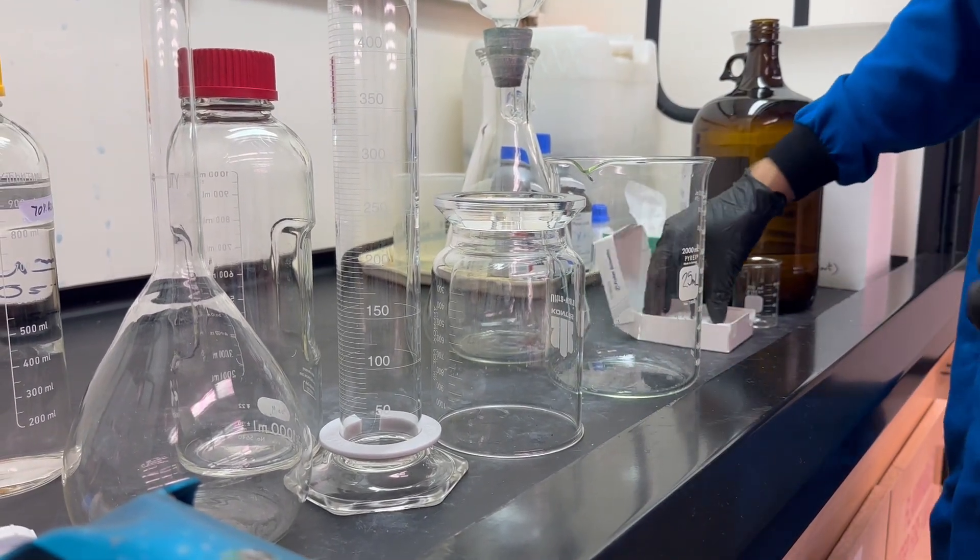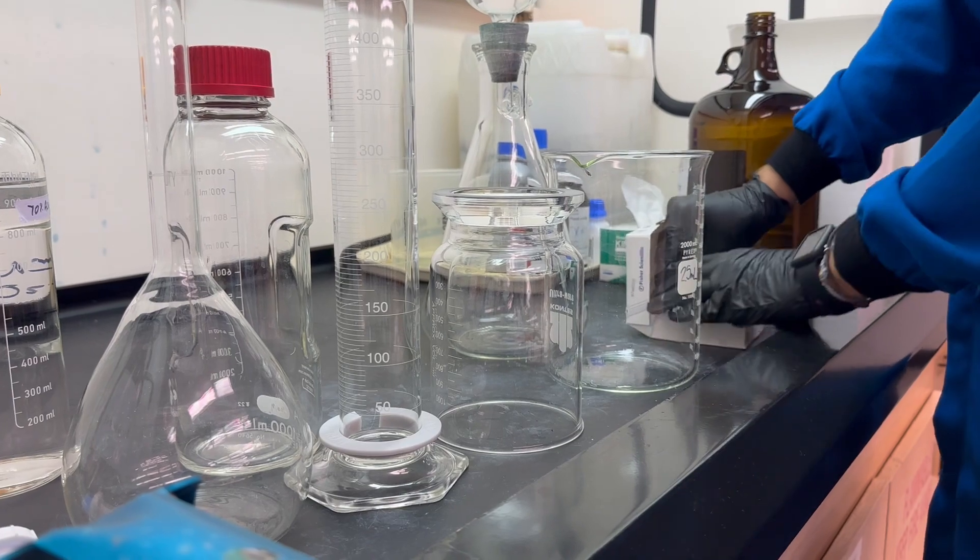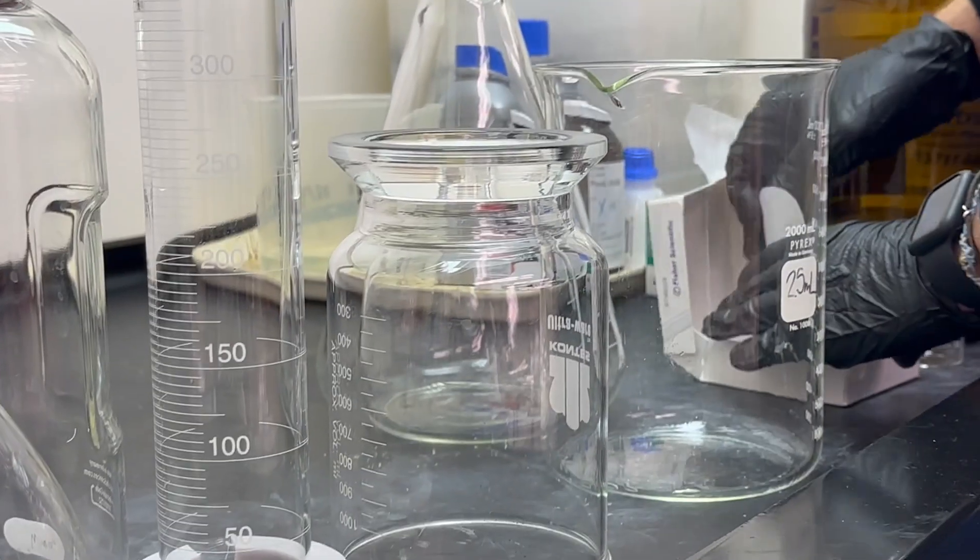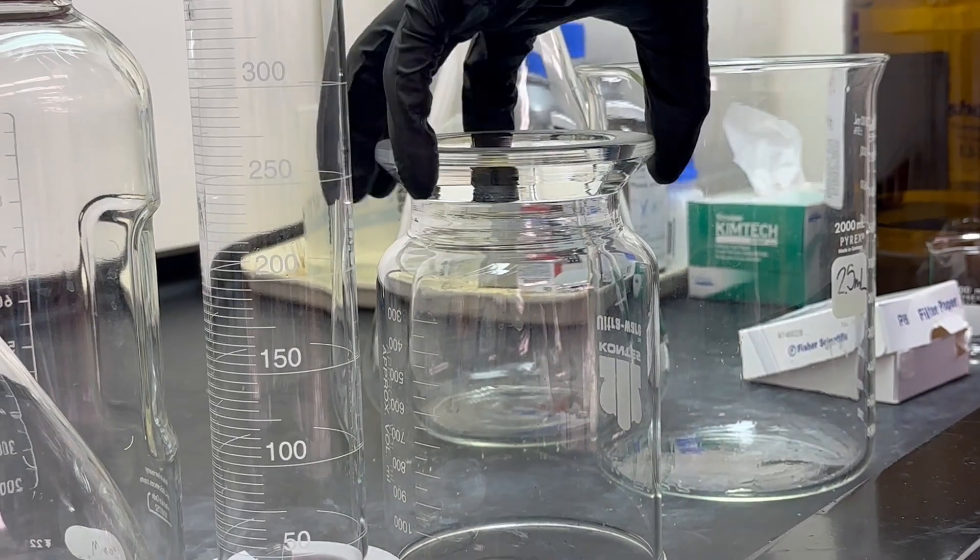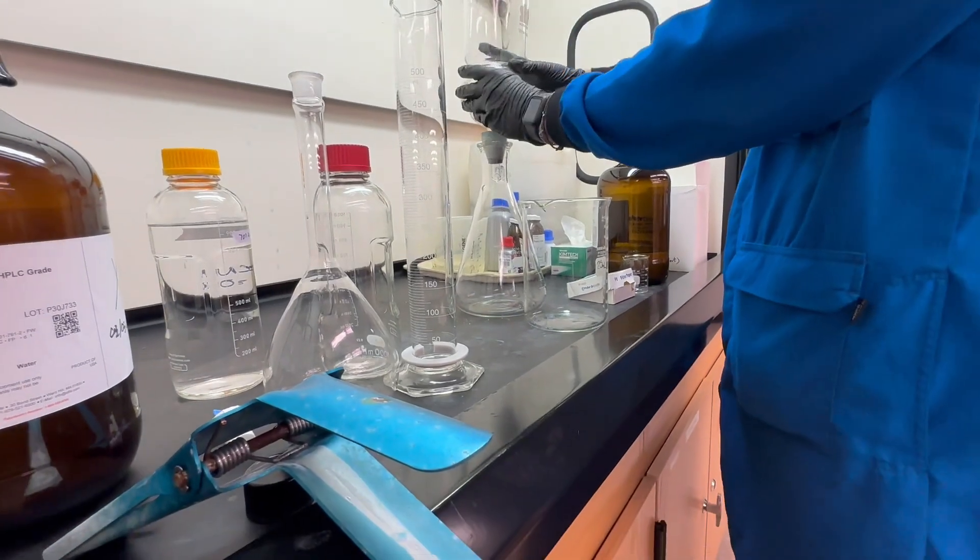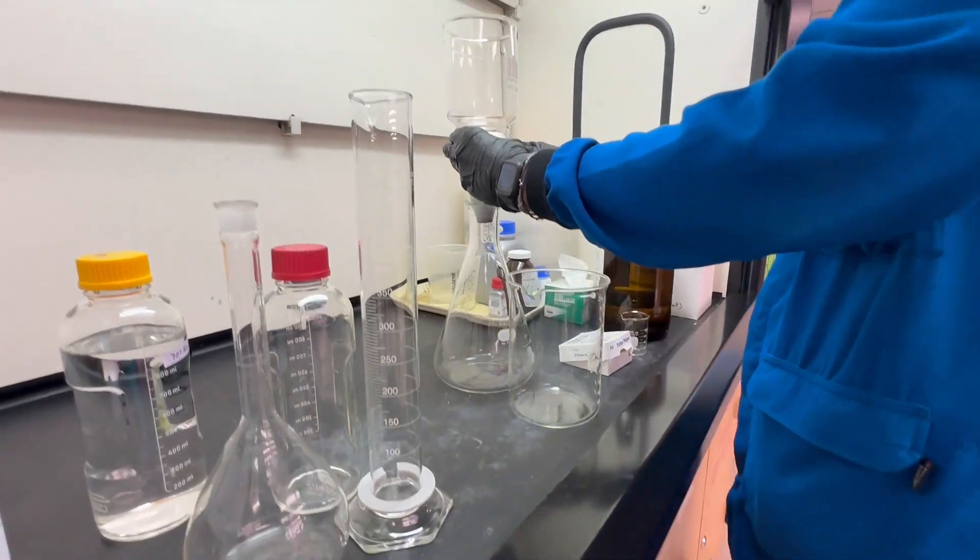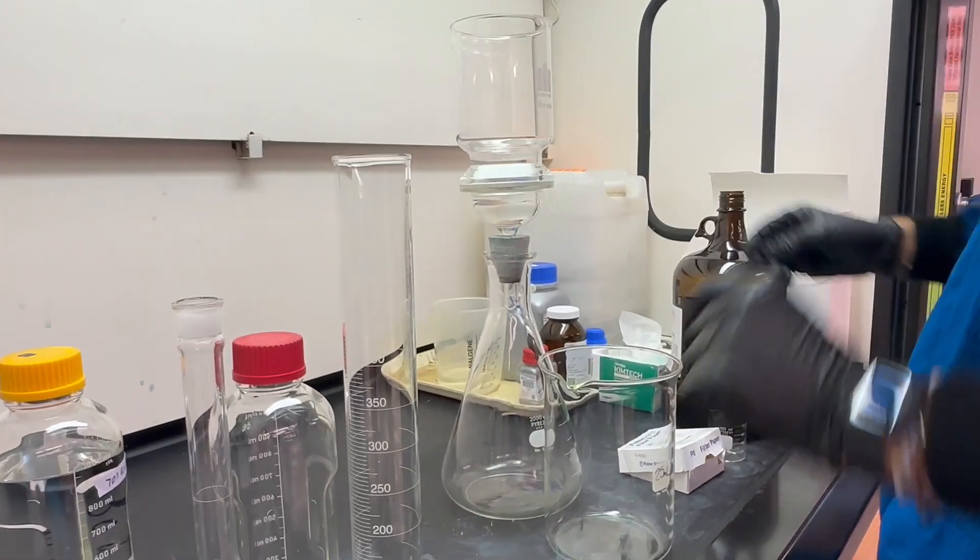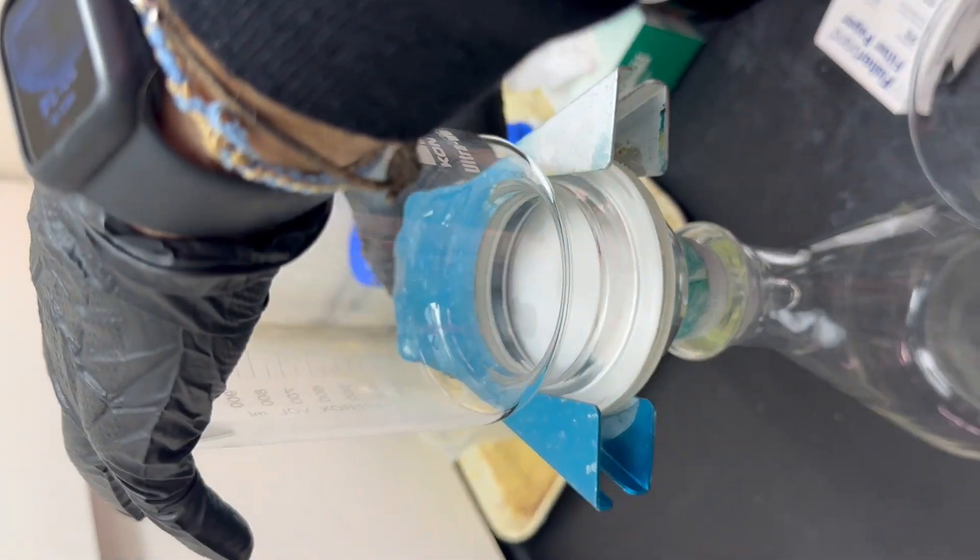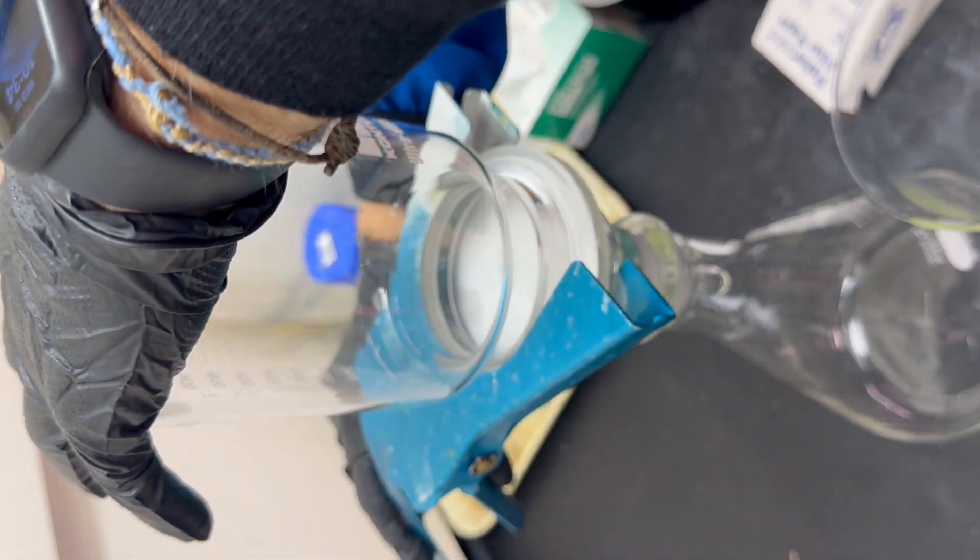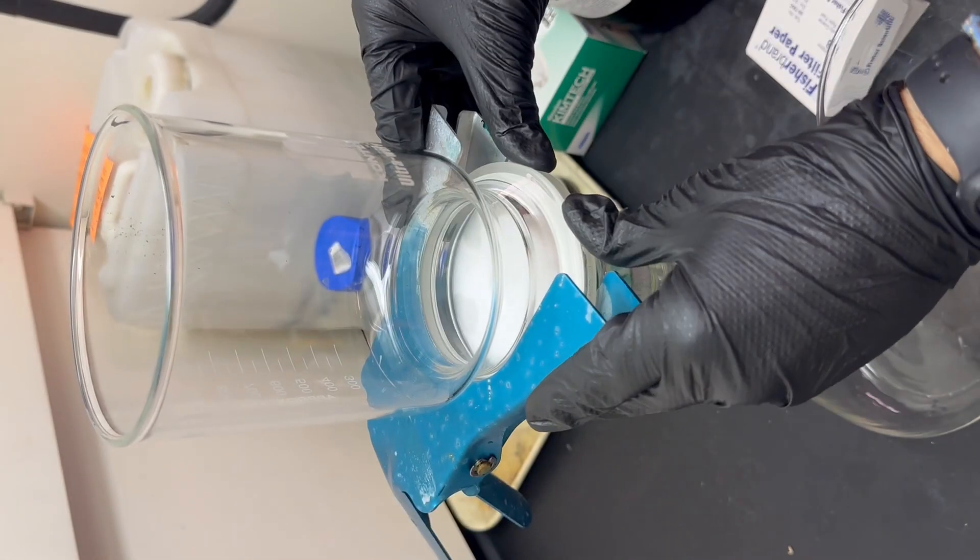The first thing we're going to do here is grab a 0.2 micron filter paper, add it in here, combine this, and then clamp it down. I'm going to clamp it so that way it's out of my way, so I can see.